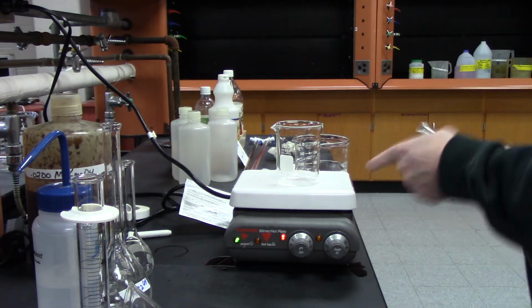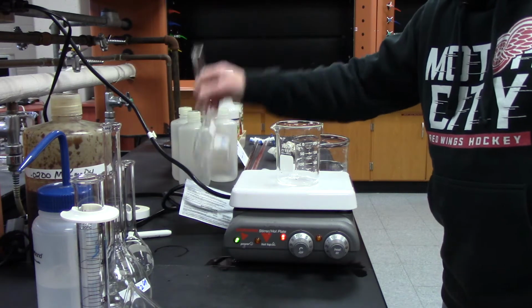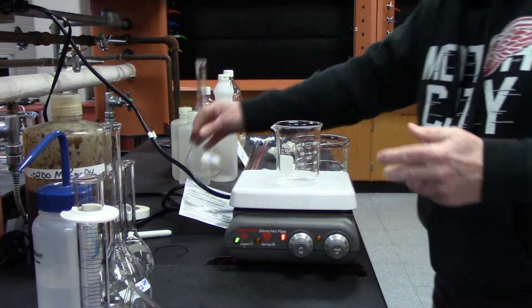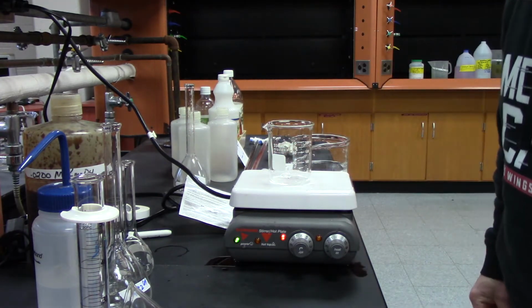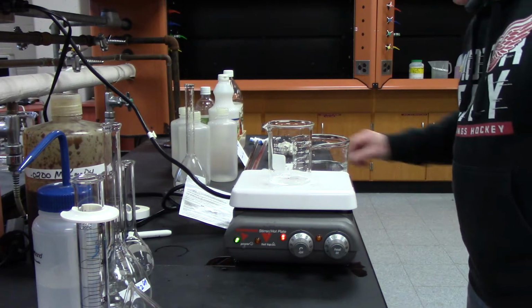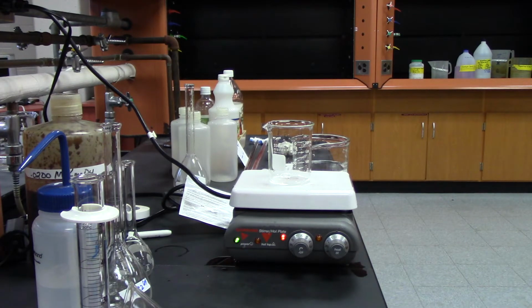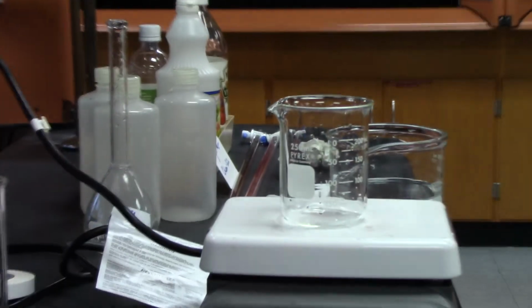But I'm going to use this to get started, and you'll see they don't want to make any mistakes with this. I want to make sure that everything gets set up in my beaker, and then what I'm going to do is transfer it to my volumetric flask. All right, so let me move in a little bit.